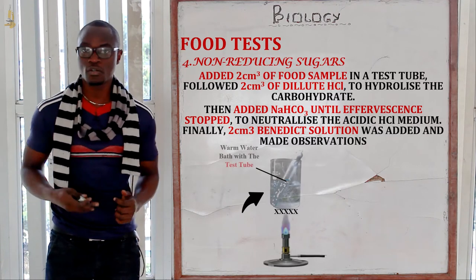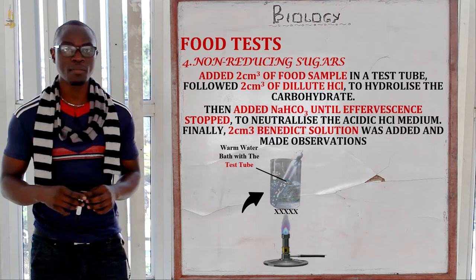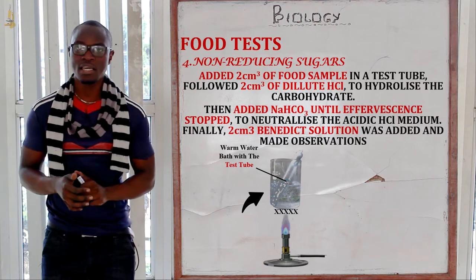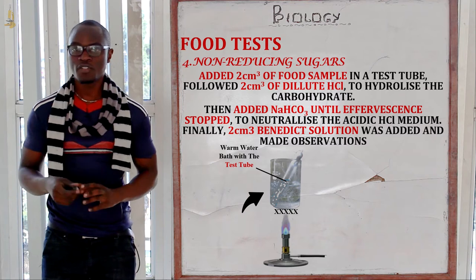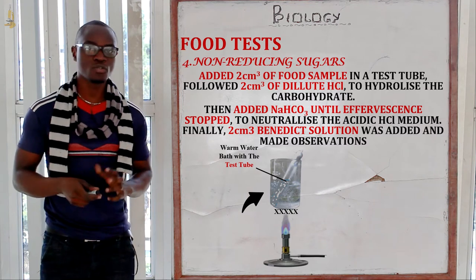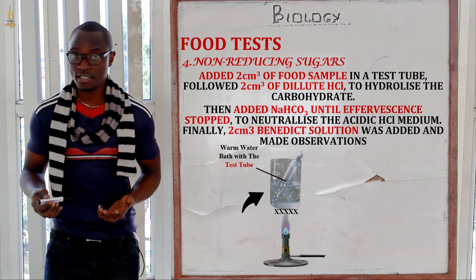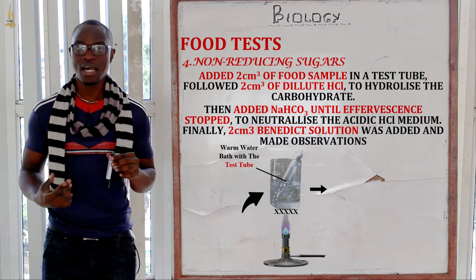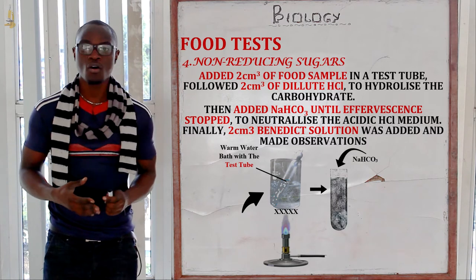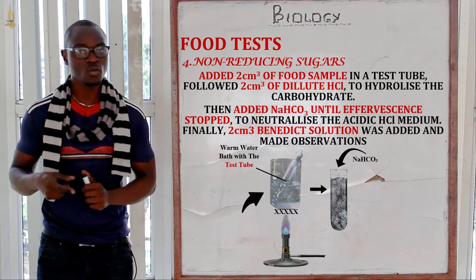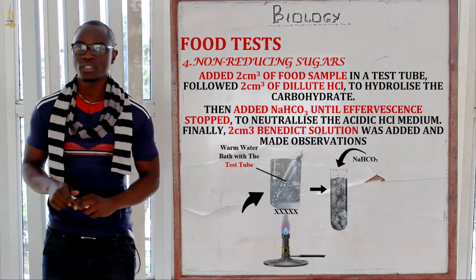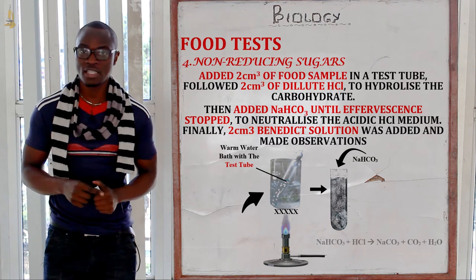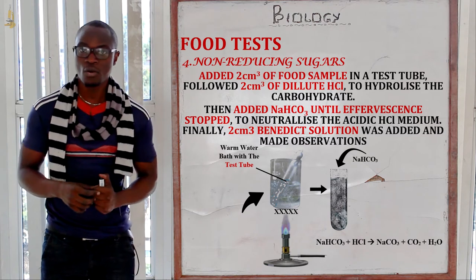After adding a few drops of hydrochloric acid, we take the test tube and place it inside a warm water bath to accelerate the chemical reaction. After placing it in the warm water bath, we extract the test tube and then add about two centimetres cubed of sodium hydrogen carbonate. When adding sodium hydrogen carbonate, you will notice that effervescence and fizzing will occur.